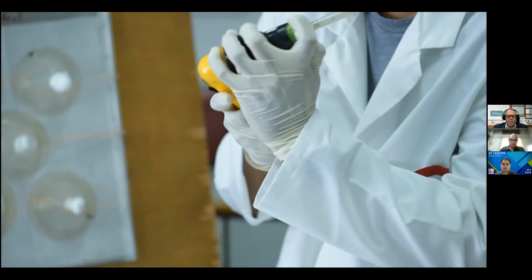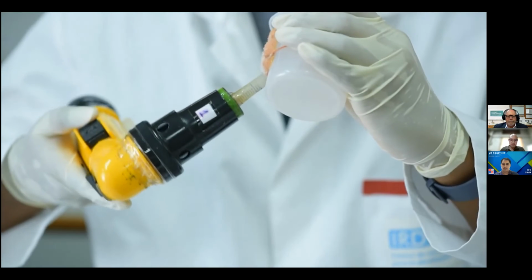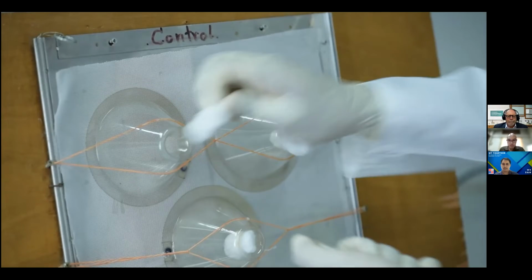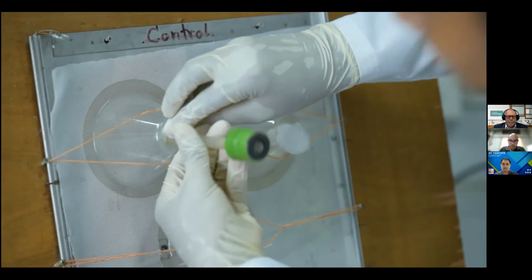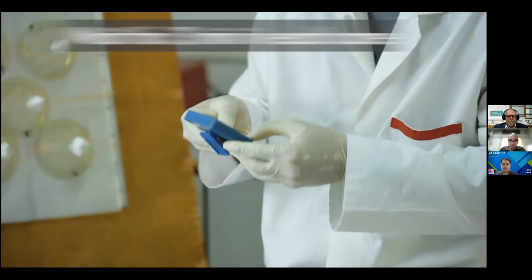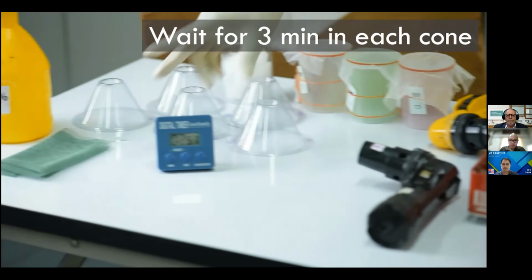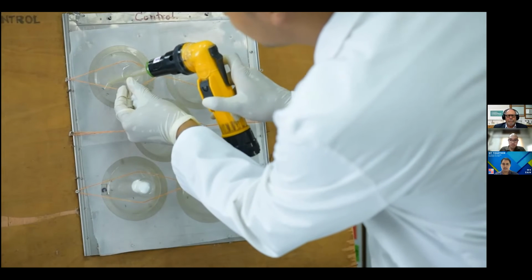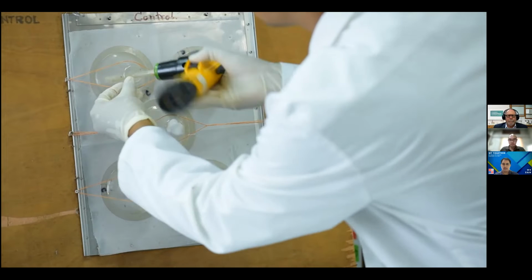Confirm that the mechanical aspirator is working with charged batteries. Aspirate 5 female mosquitoes into the tube. Carefully blow the mosquitoes into the cone and block the hole with cotton wool again. Check the time. You need to expose these mosquitoes for only 3 minutes inside the cone. Then aspirate the mosquitoes back into the cup.